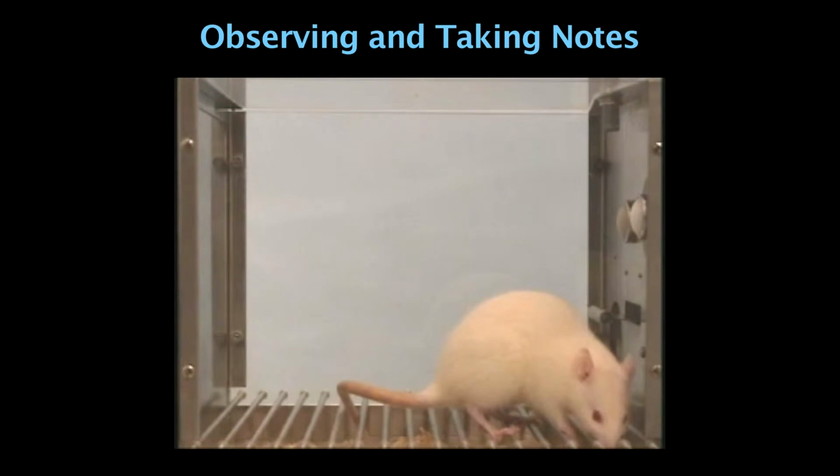Note that when the hind legs stop moving, the animal may continue to explore the chamber by sniffing, moving its head around, or even shifting positions without actually changing locations. We may even want to include all such variations into a single category, such as generally exploring aspects of the chamber.